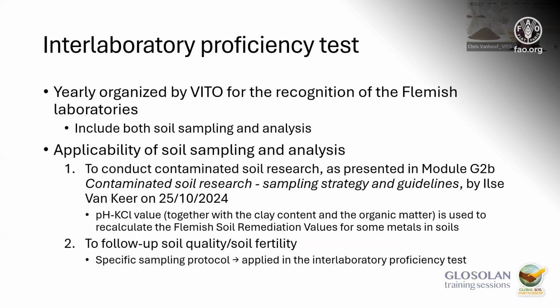About the participation in the interlaboratory proficiency test. Yearly, VITO organizes these round-robin tests for the recognition of the Flemish laboratories. And it includes both the soil sampling and the analysis. So not only the pH measurement, but also the soil sampling.